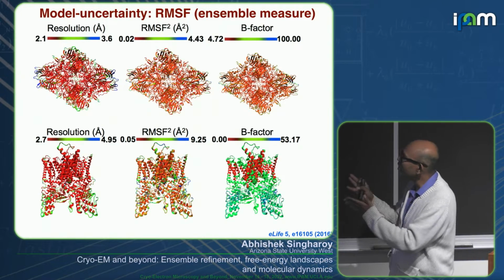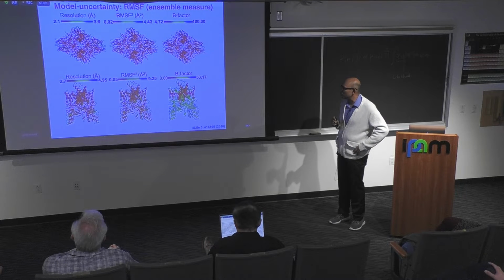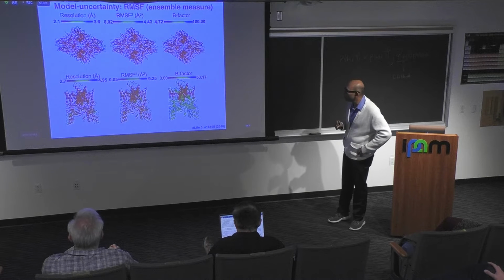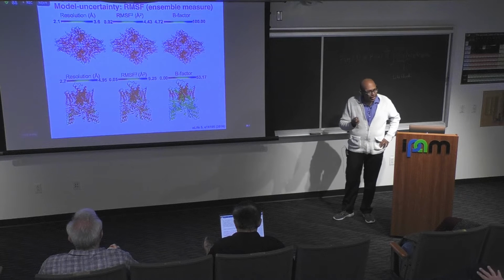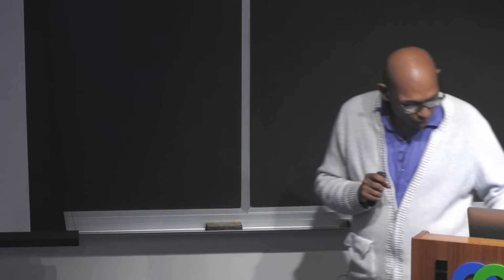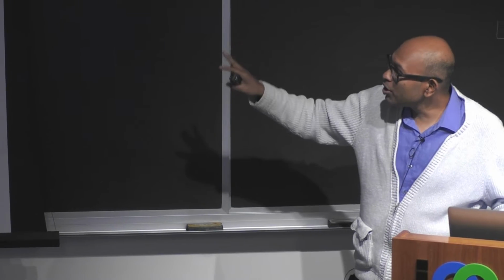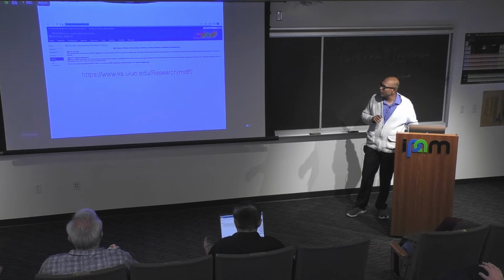So somehow the uncertainty of the fitting matched more or less okay with the resolution. So we were like, okay, fine, we're doing a good job. But then this idea that there can be some statistical mechanics, some probability distributions, the log of which can be called an energy function, remained with us. Of course, people can use this tool. It's a very useful tool. It's popular. So this is the website from which you can download and use this. We have good tutorials and all that.